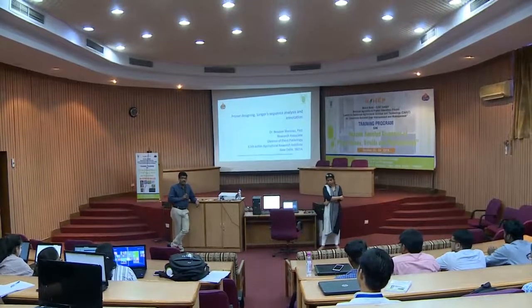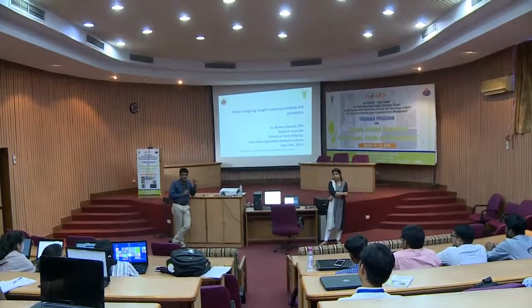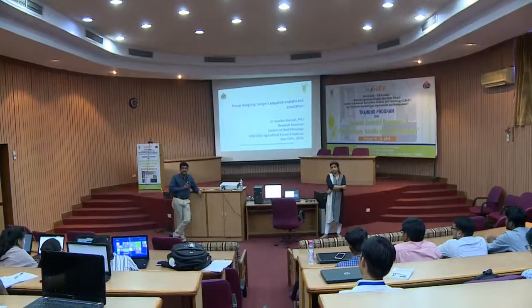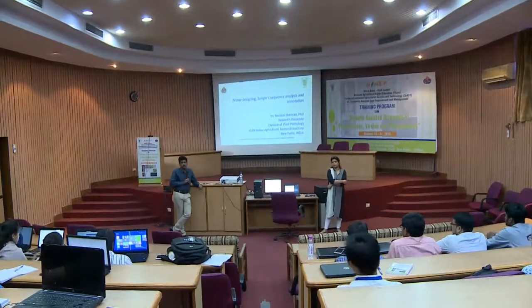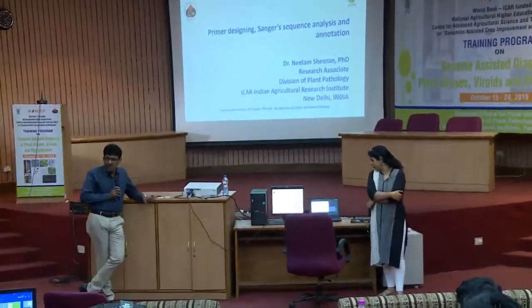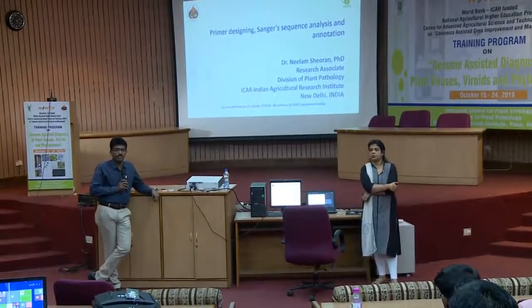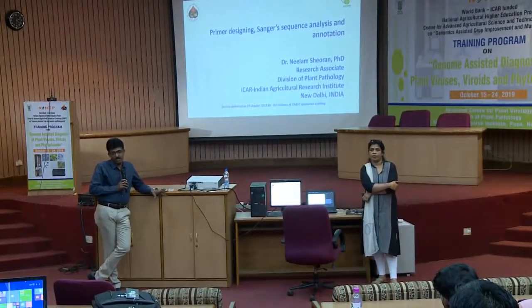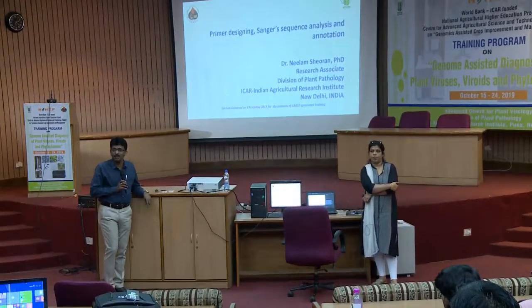And I'm sure you will enjoy the finer details she is going to reveal to all of you, and follow her lecture and also the demo she is going to give here with some sequence examples and using some of the software used for sequence handling. The highlight of this lecture would be basically on how to handle the software.